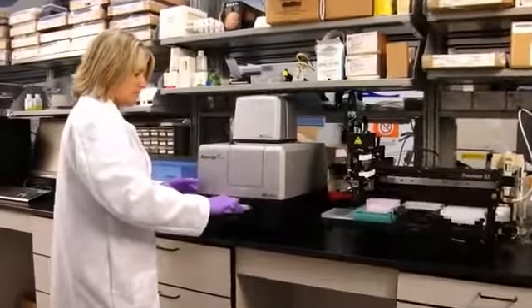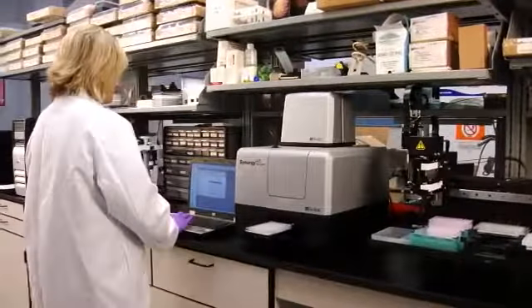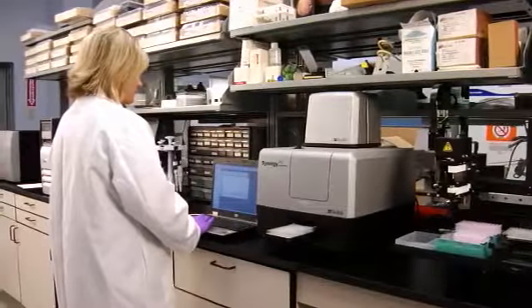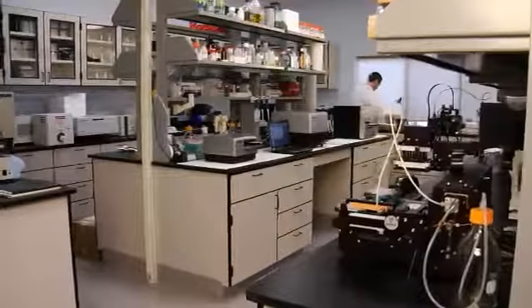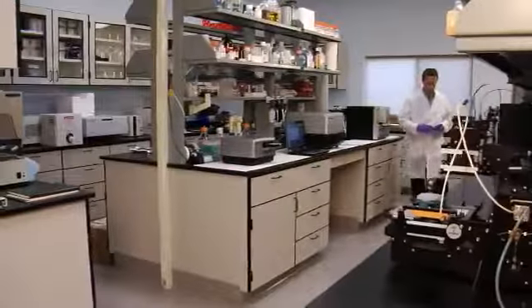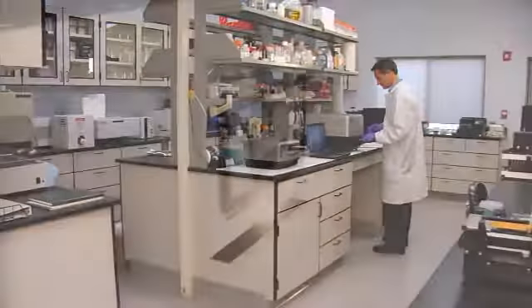As you can see, Synergy H1 has been designed to combine ease of use and versatility in one compact benchtop instrument. Its unique patent-pending hybrid optical system will give your laboratory the flexibility it needs, as well as the ability to upgrade to more advanced detection modes as your requirements expand.